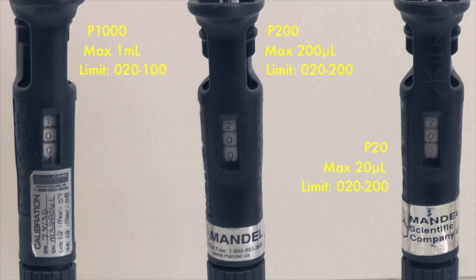For P20, the dial at 200 indicates 20.0 microliters, and 020 indicates 2.0 microliters.